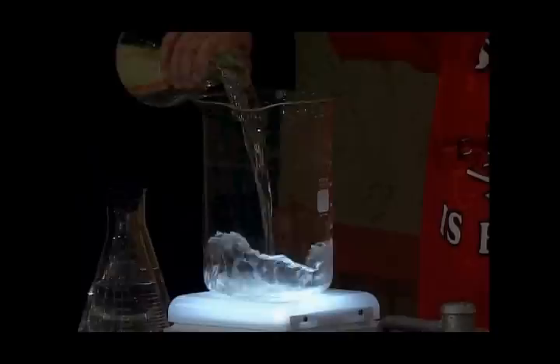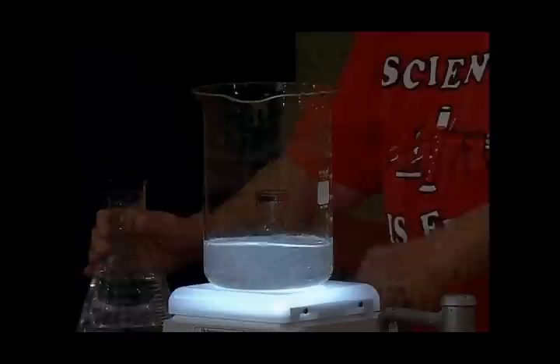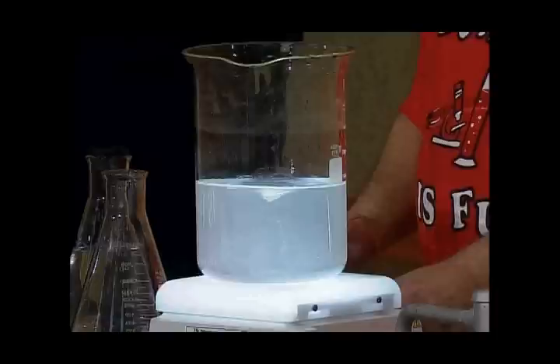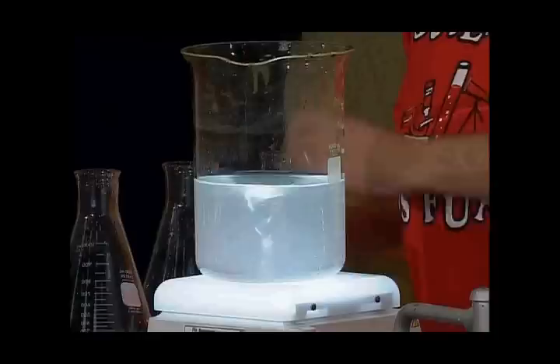All right, so I'm going to take a clear and colorless liquid and put it in a beaker, just like that. And I guess it's not so clear right now, but it's a little bit cloudy. That's OK. And then I'm going to take another clear and colorless liquid and put it in there. Anything interesting happened so far? Well, the volume increased, you know, and what else? You see a little tornado, right? I hope this is the only tornado you see. And then I add the third one, and here's the third one.